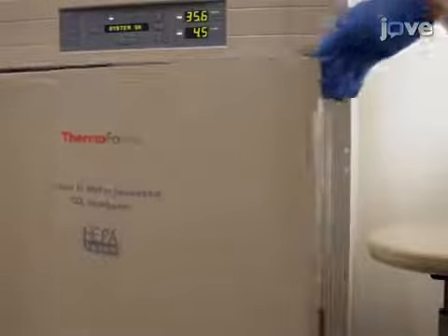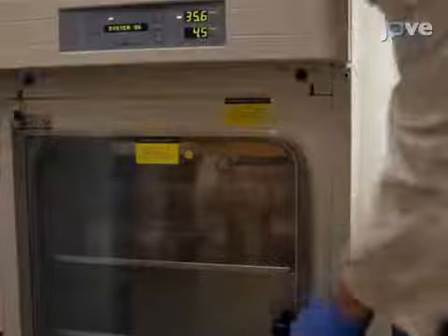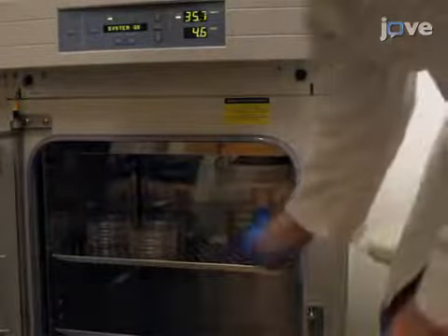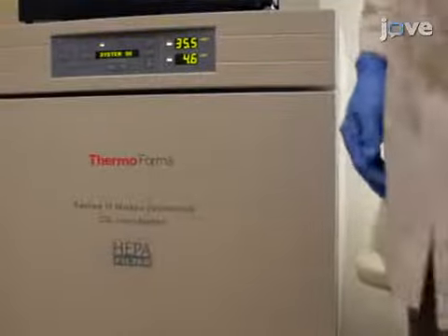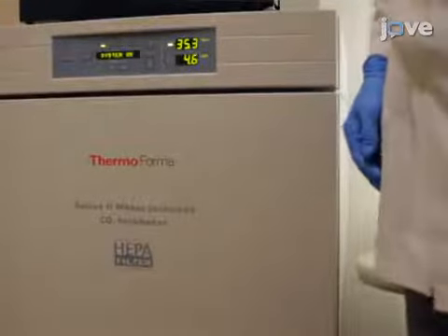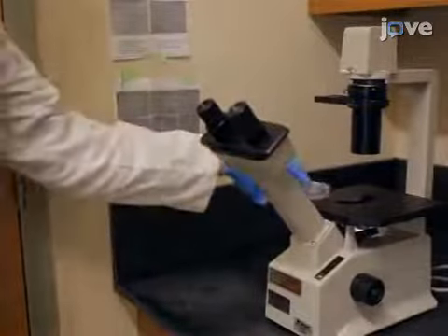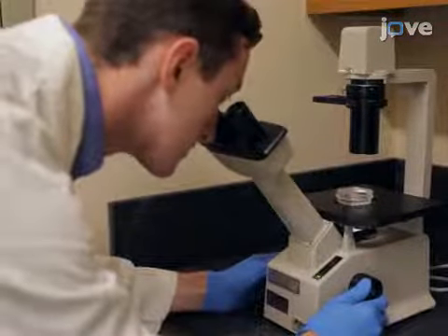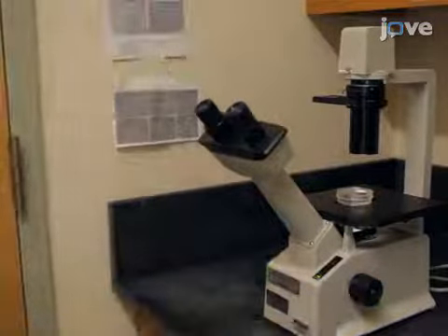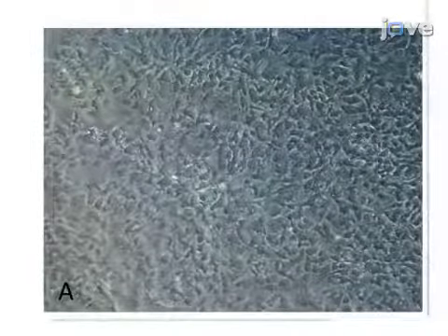In this demonstration, the scratch assay will be used to quantify the migratory capacity of murine lung mesenchymal stromal cells, or MSCs, after exposure to soluble cigarette smoke extract. The MSCs are grown in complete media on 60 mm plates and damaged as described in the protocol text. An appropriate confluence is important for the scratch assay because it ensures that the imaging software can correctly identify the boundaries of the scratch. This example shows MSCs at 95% confluence, appropriate for scratching.